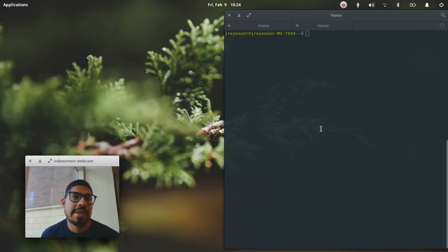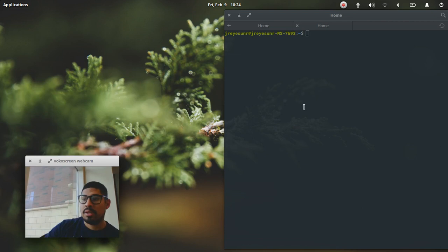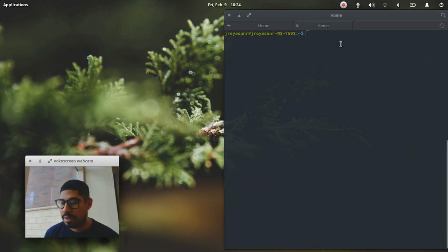Hello everyone, so today I'm going to be going over how to do the HISAT tutorial, and we're going to be doing the first part of it. Essentially what we're trying to target is getting a SAM file out of this, so that's going to be our output. I have done this, so I'm just going to glance over some of the steps.